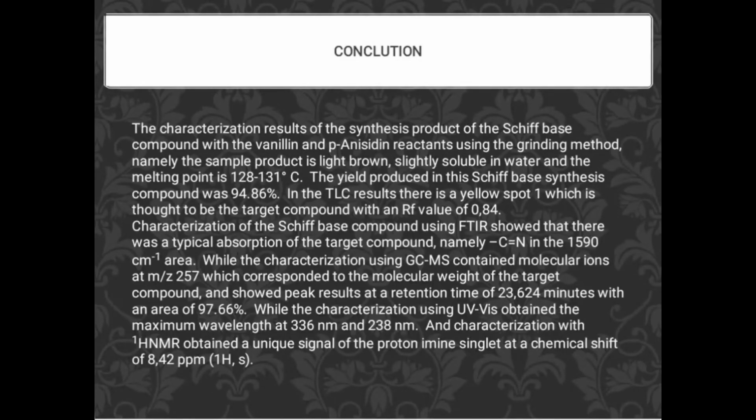with an area of 97.66%, while the characterization using UV obtained the maximum wavelengths of 336 nanometers and 238 nanometers, and the characterization with H-NMR obtained a unique signal of the imine proton at a chemical shift of 8.42 ppm, 1H.